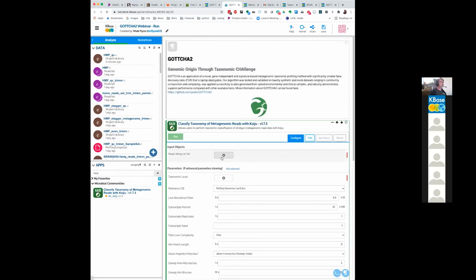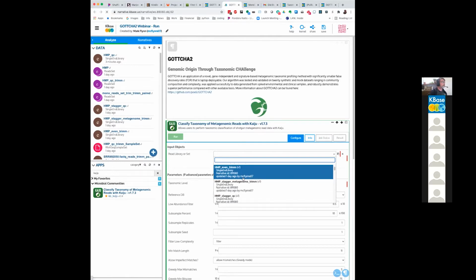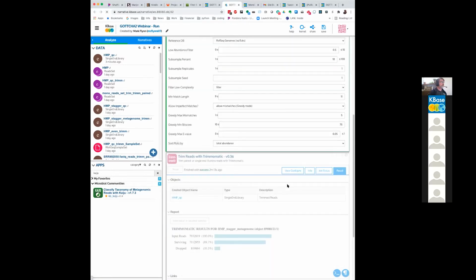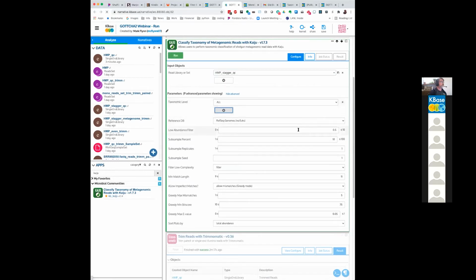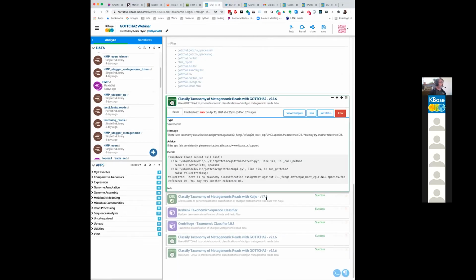So we will pick all and click run. Okay, now let's look at the output of Kaiju.